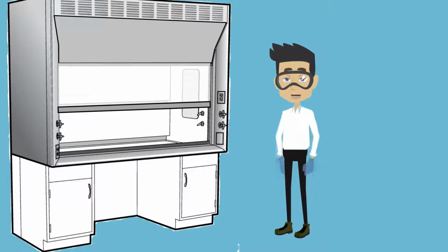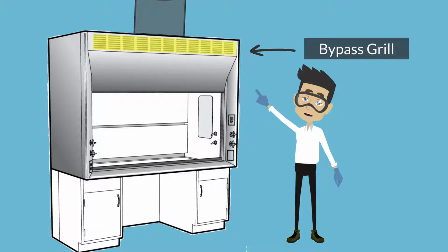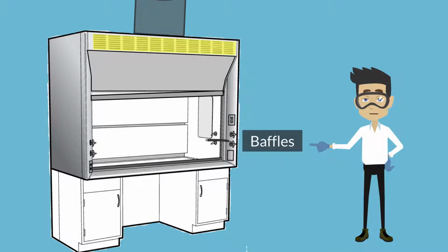Let's first talk about the parts of a fume hood. Bypass fume hoods, as seen here, are typical at NIST. They are designed and constructed to allow room air to enter the fume hood by a route other than the sash opening. Bypass hoods have a grill at the top where air enters. This limits the increase in face velocity through the sash opening and results in a relatively constant exhaust airflow rate. The sash, along with the bypass grill located above, determines the airflow characteristics of the fume hood. The baffles, in the back of the hood, direct the air to follow specific air patterns within the hood and also support a uniform air velocity.